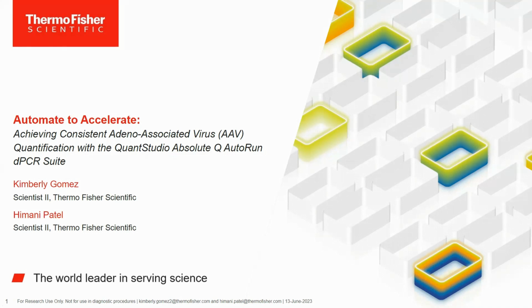Thank you, Christy, for the introduction. Hello, everyone. My name is Himani Patel, and I'm a molecular biology scientist here at Thermo Fisher. I'm also joined by Kimberly Gomez, also a scientist at Thermo Fisher. Today, I'm thrilled to have the opportunity to share advancements in automating digital PCR workflows, particularly in the context of achieving consistent AAV quantification using the QuantStudio Absolute Q auto-run dPCR suite.